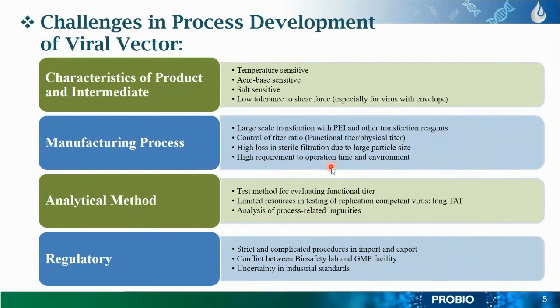Therefore, we have first focused on solving these drawbacks associated with the production and purification of lentivirus under good manufacturing practices. Actually, in recent years, we have seen the development and optimization of new protocols, packaging cell lines, and different culture media, which is very important to optimize.